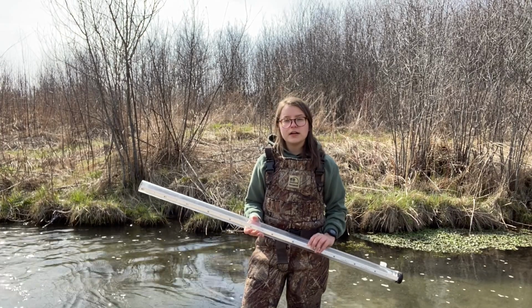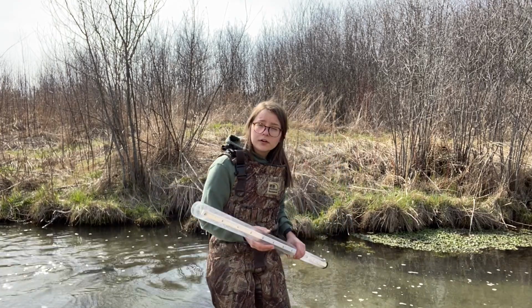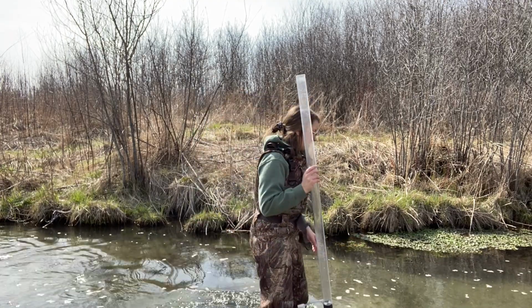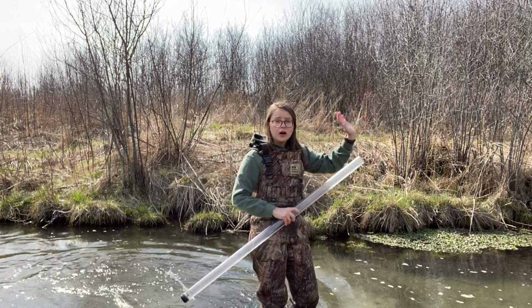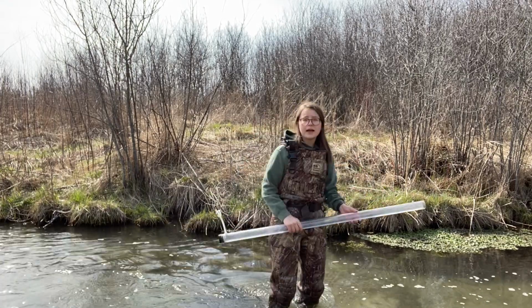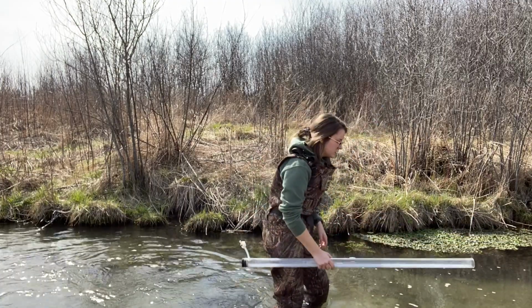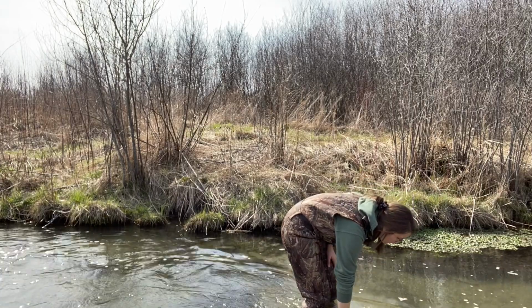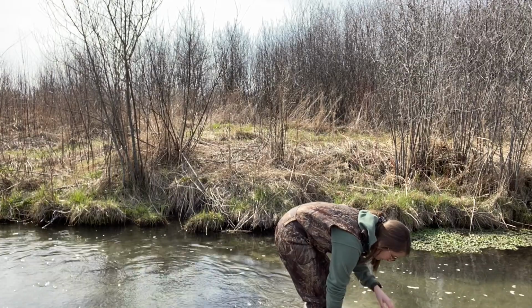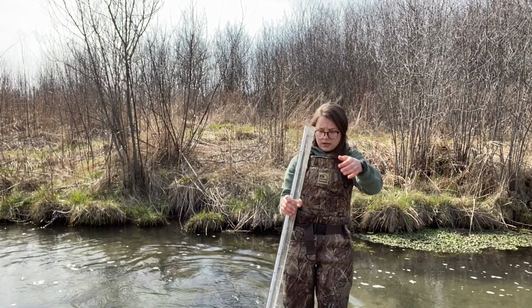The next thing we'll measure is the clarity of the water, which is also known as the turbidity. In order to do this, we'll take our turbidity tube or clarity tube and stick the opening of it upstream of us. Once again, we don't want to get the sediment that we kicked up. That can give us inaccurate results. So what we'll do for this is we'll stick the tube all the way down in the water and fill it up. So once it's filled up, I'll go ahead and take my hand and place it over it so I keep the water within it.